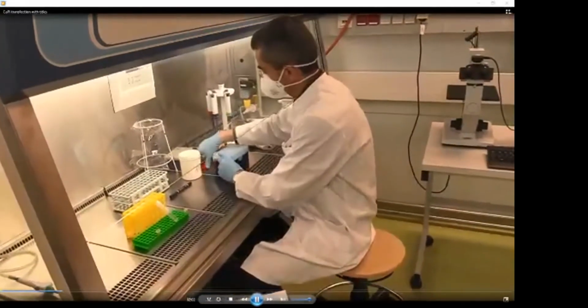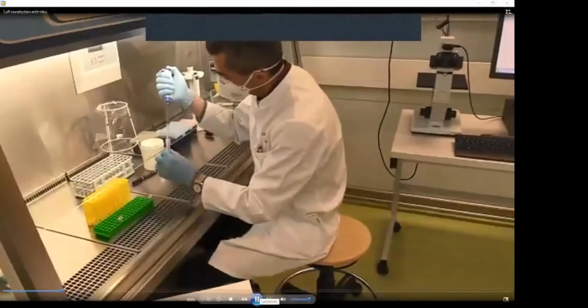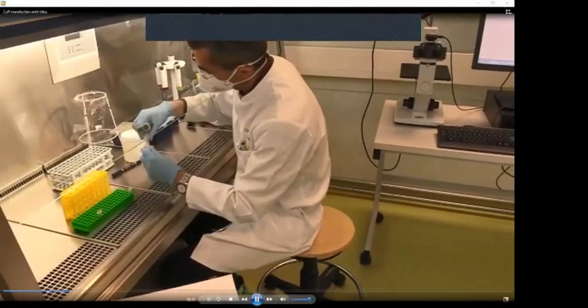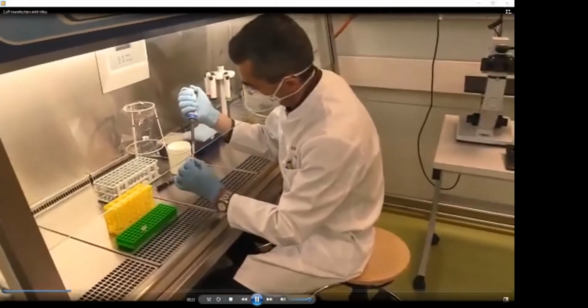Then we take this sterile tip and the HBS, the correct volume, which is this 520 microliters, and pipette that carefully. That means that it has to be this 520 into the tube number A.